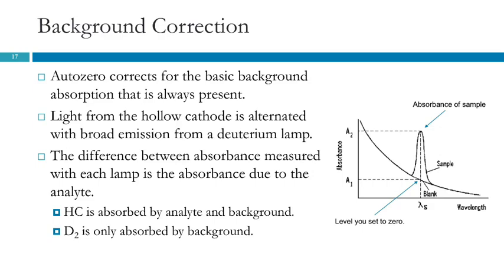So if you've used our instrument, you know that you have to go through this process of zeroing it beforehand, and it makes all these chunking sounds and clunking sounds, and you're like, is it okay? That's fine, it always does that. So auto zero is going to correct for the basic background absorption that's always present.